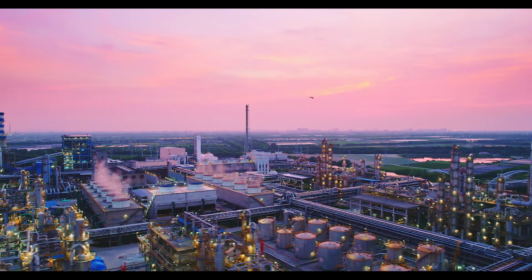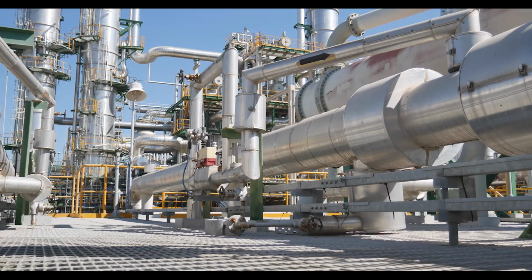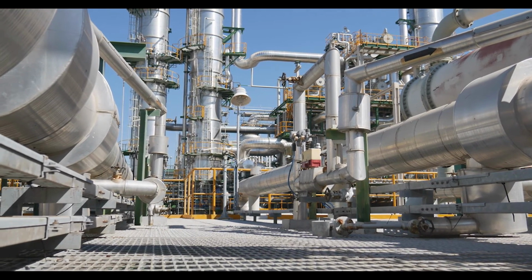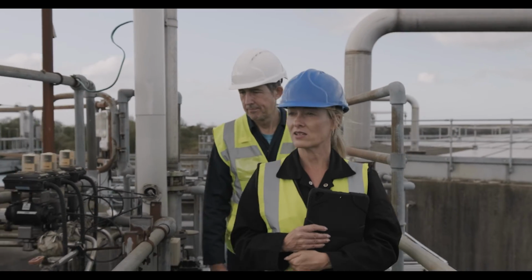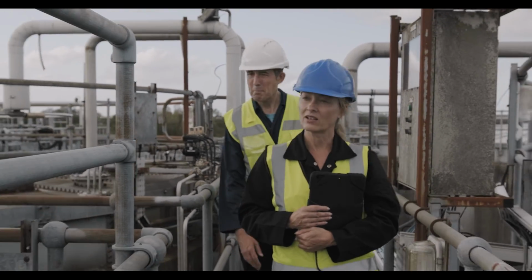One of the most critical remaining questions about PFAS in North Carolina is tracking down the sources of PFAS in drinking water. We're going to use this new instrumentation to address that problem so that we can understand where the PFAS is coming from and figure out ways to either treat it or shut them off at the tap.